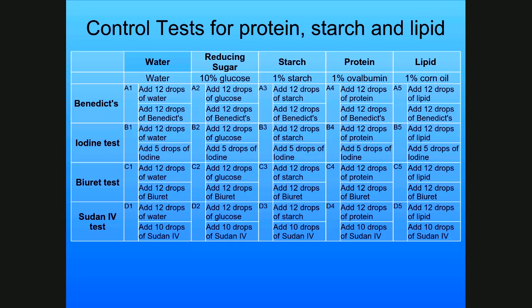When we do this in the lab, we spend the most amount of time with this setup, actually. I want you to look at this in case we have the ability to actually go in the lab so that you can set this up.